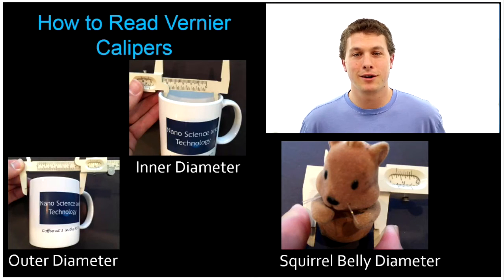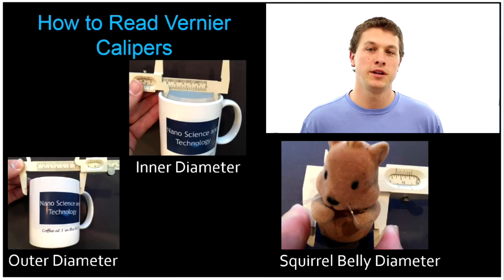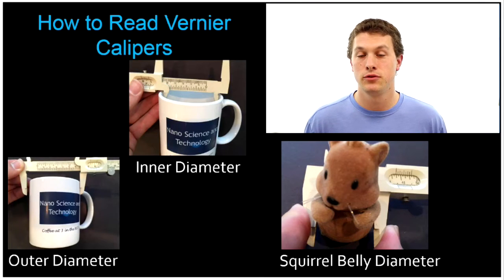Welcome to Real Chemistry. I'm Dr. Morris. Today on the show, we're going to read vernier calipers. Vernier calipers are pretty nifty because you can read things to a very high precision, namely distances.